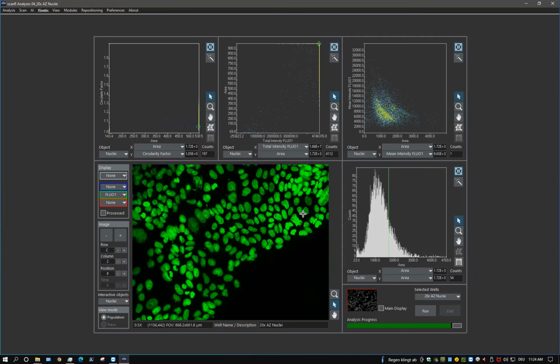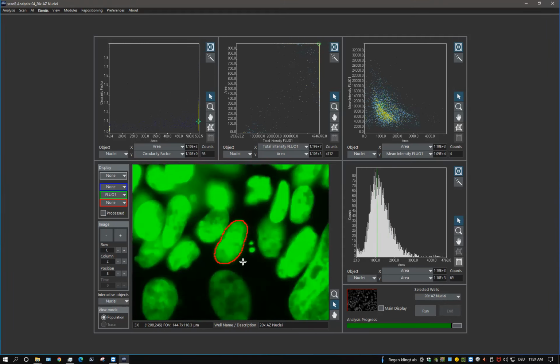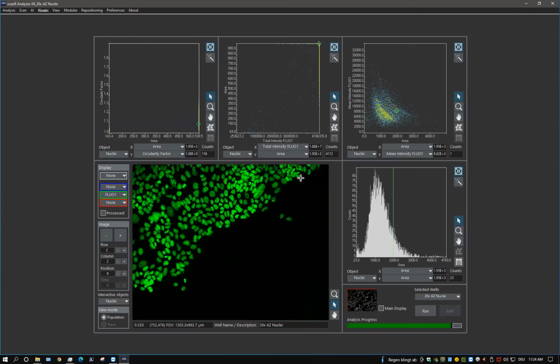And let's go somewhere else, maybe here. So these networks are, I think this is human level, maybe not the super expert of the application level, but for pre-trained networks, this is really something that we can work with.